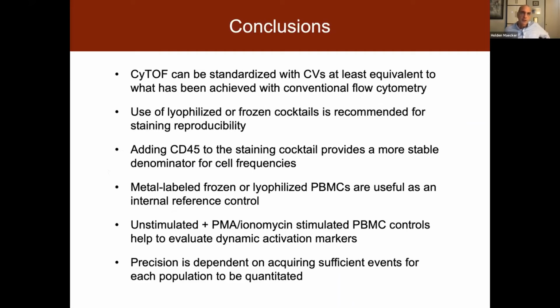Okay, so that brings us to the conclusion. We felt that we could standardize our CyTOF assays across sites quite well, at least equivalent to what has been achieved with conventional flow cytometry, a standardization effort that goes back a number of years that I've also been involved with. And I can tell you that these CVs that I showed you are at least as good and often better than what we saw with conventional flow.